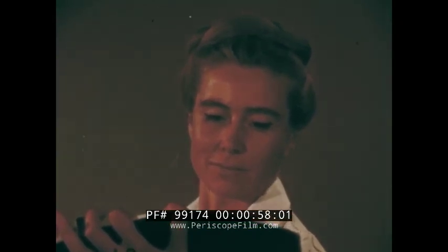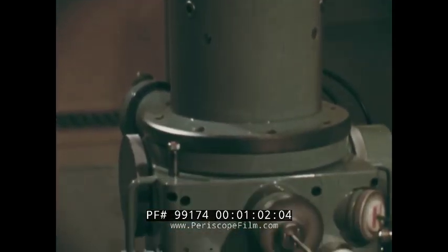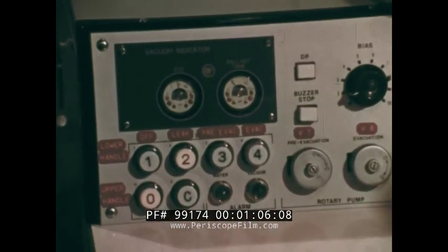This is a recent photo of a second-year medical student. It conveys a good deal of useful information, but it fails to tell us that she's a pretty girl. That fortunately takes 3 dimensions, which is the way we see, the way we comprehend, the way we think. In the same way, we need an instrument that can give us a comparable insight into the microscopic world. That briefly is the reason for the scanning electron microscope.